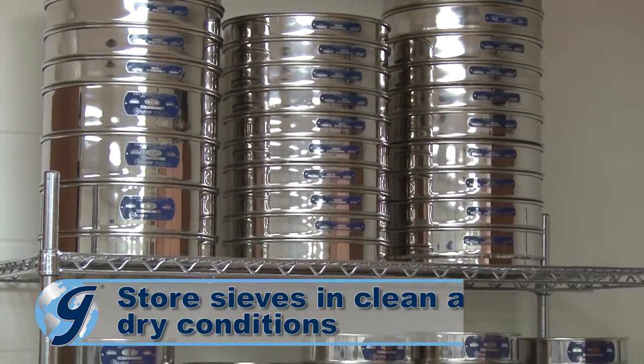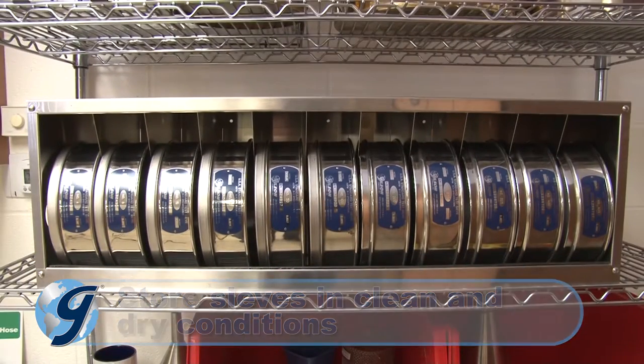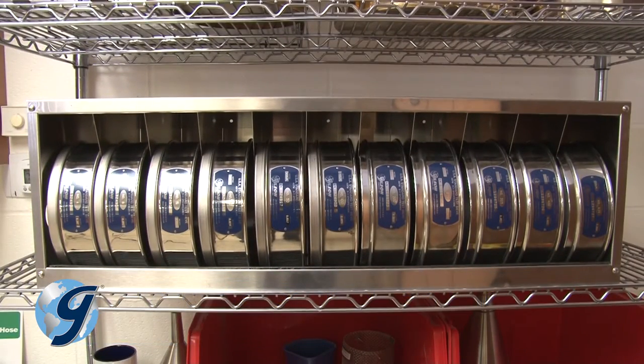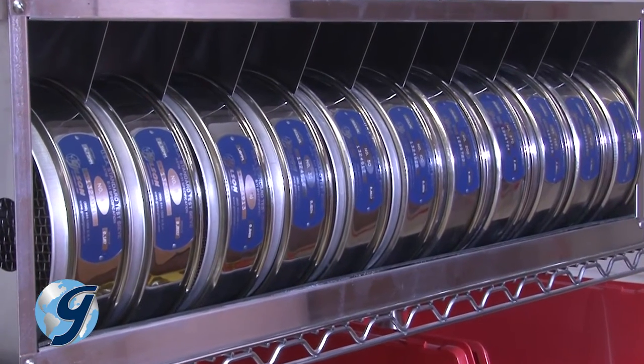Store test sieves in clean and dry conditions. A vertical rack with separate compartments prevents damage during storage and keeps sieves organized for easy access.